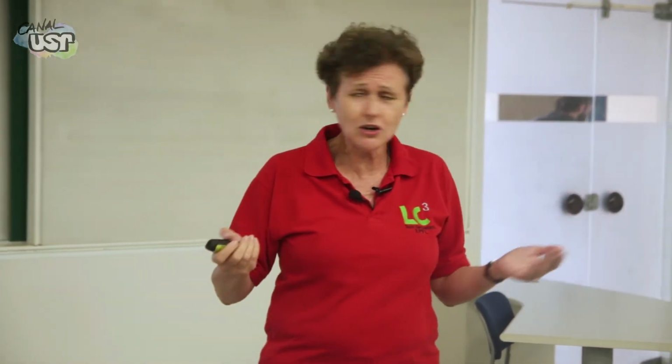But 9 studies out of 10 are the same. People are studying cement. The person down in the next lab said, oh, we've got this scanning electron microscope. They try to do this kind of picture, but it's a waste of time. Please don't do it, okay? Because it really upsets me that there's so much time, instrument time, human time, wasted on these kinds of things.